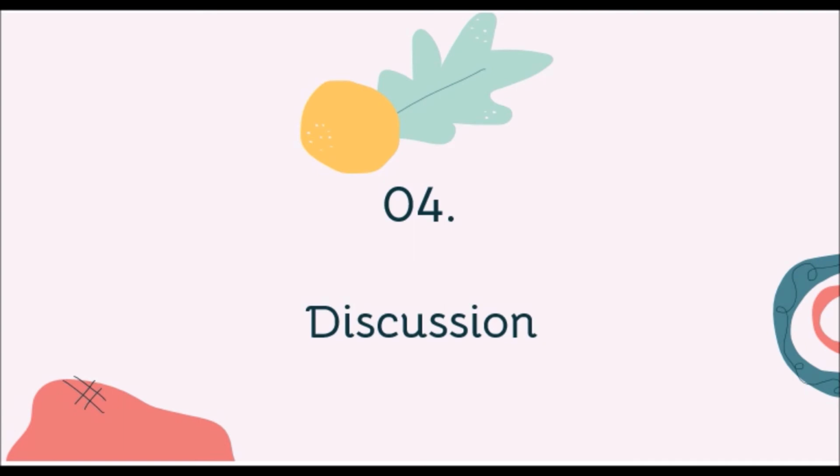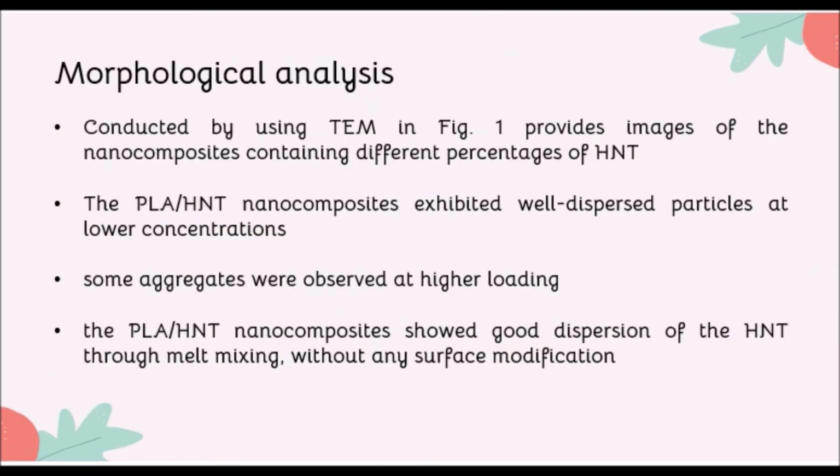And the fourth is the discussion. So for the morphological analysis conducted by the TEM, Figure 1 provides images of the nanocomposite containing different percentages of the HNT.